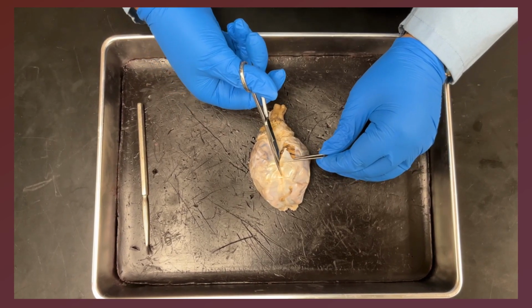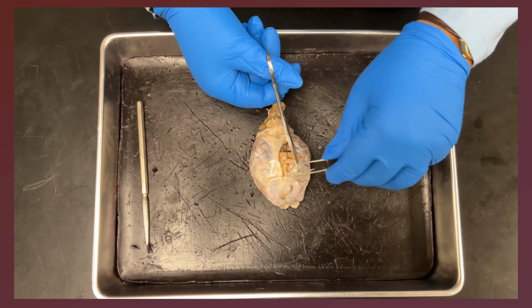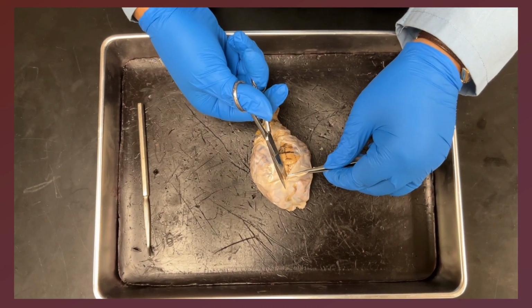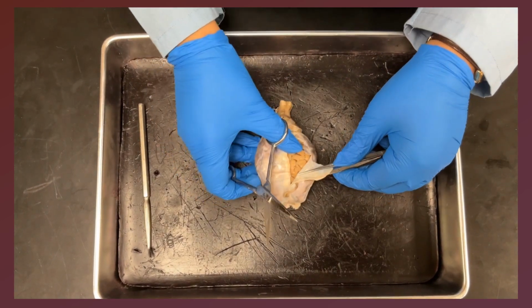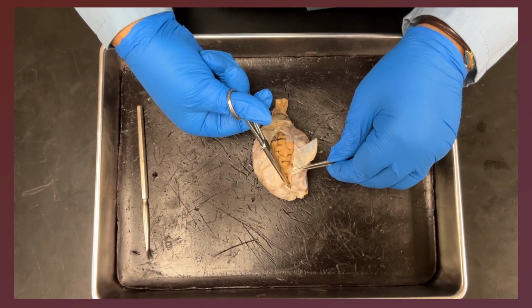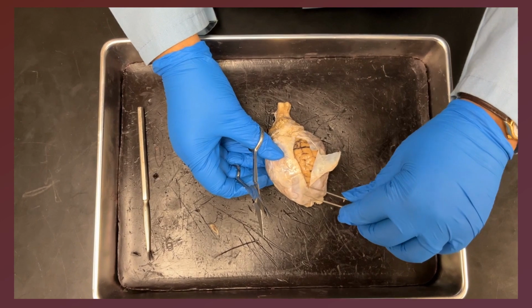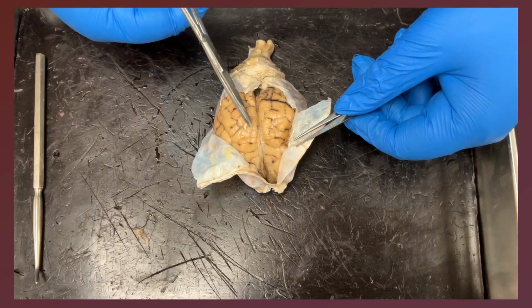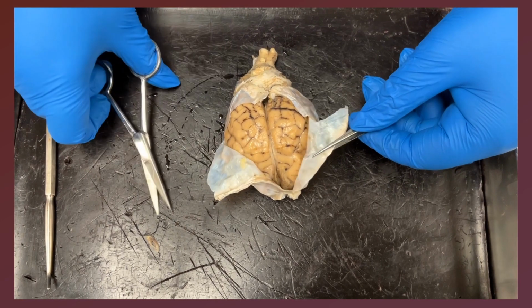I am removing the meninges. Take extra care to first look how you are putting your scissor and then make the incision, otherwise you will damage the brain tissue. So I prefer to dissect following along the longitudinal fissure first. See how I am gradually removing the meninges.